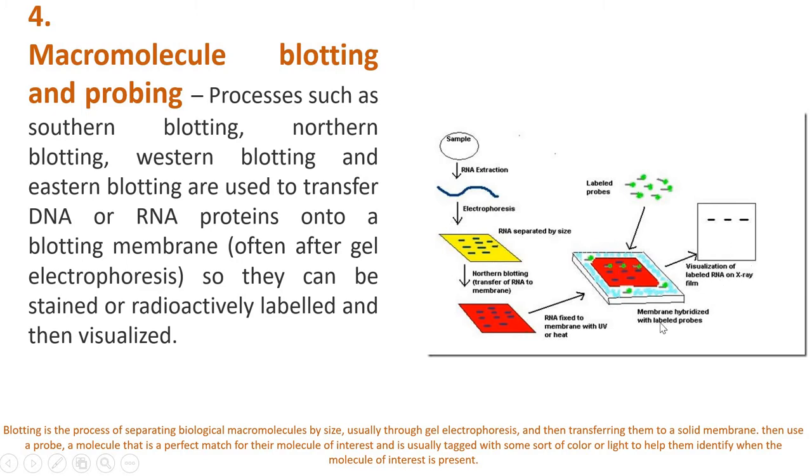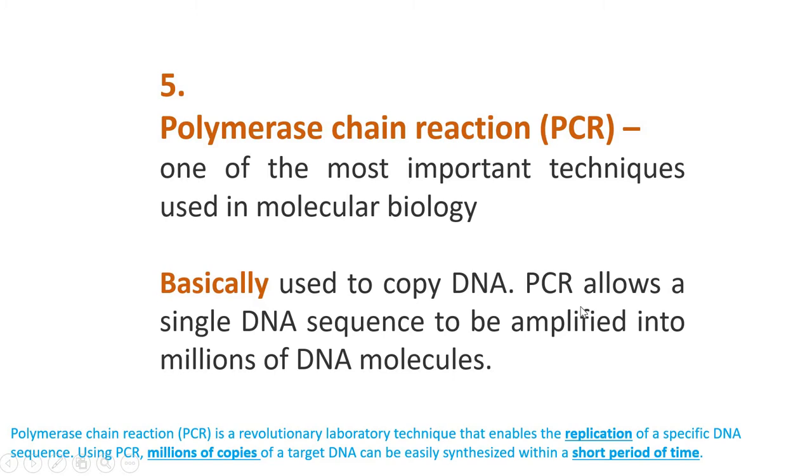نقول هذا visualization of the labeled RNA on X-ray film فنقدر نحدد التايب اللي ممكن راح يطلع لنا بالاكس-راي فيلم لانه كل مولكيول اذا احنا جبناها من السامبل تتحد او ترتبط مع او يعني labeled بروب تطلع عندي بالاكس-راي فيلم. فبالتالي الاذر بروبز اللي هي ما صار بها conjugation or identical مع molecules اخرى ما راح تظهر عندي بالفيلم وبالتالي انا احدد فقط المولكيولز اللي ارتبطت مع الراديو اكتيفلي ليبلد بروبس.